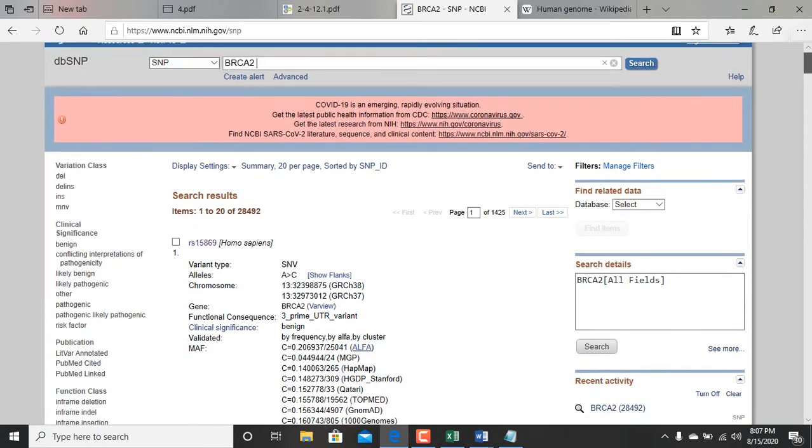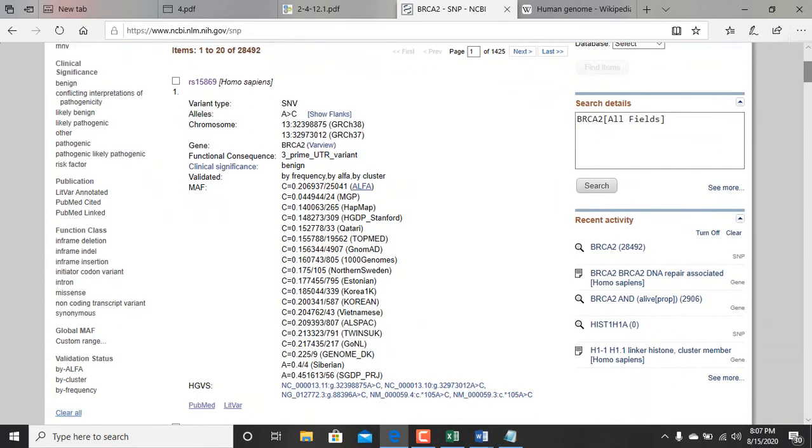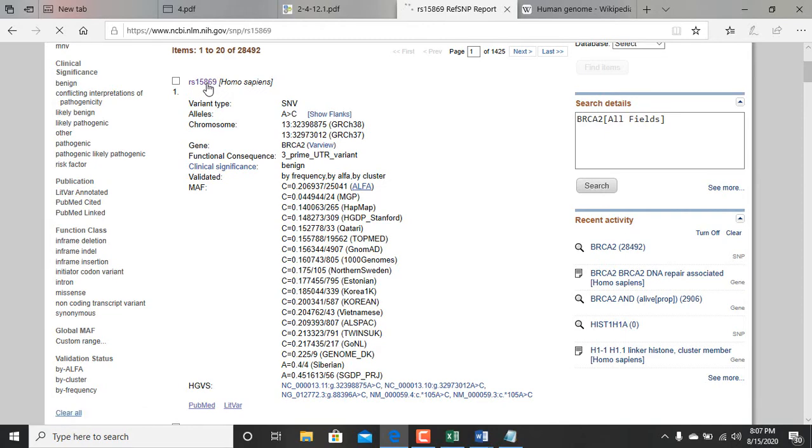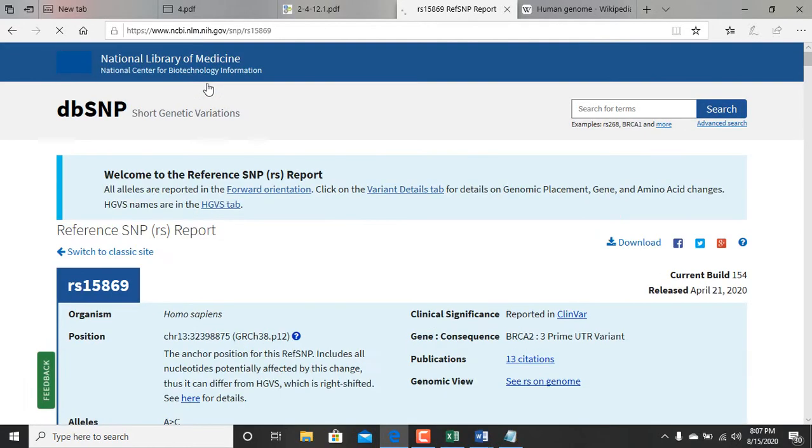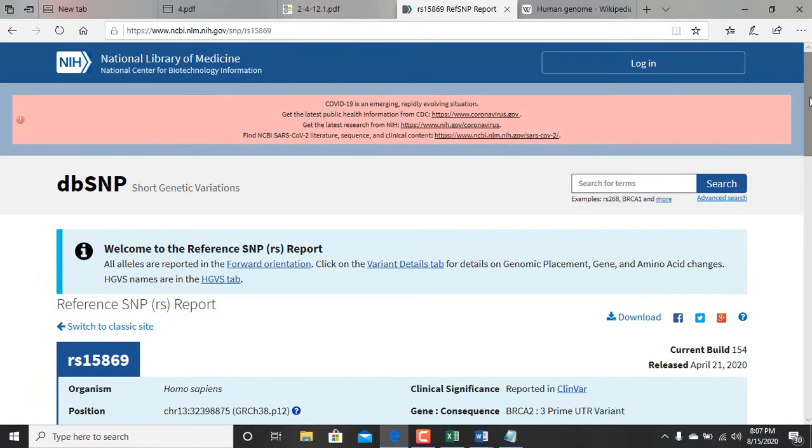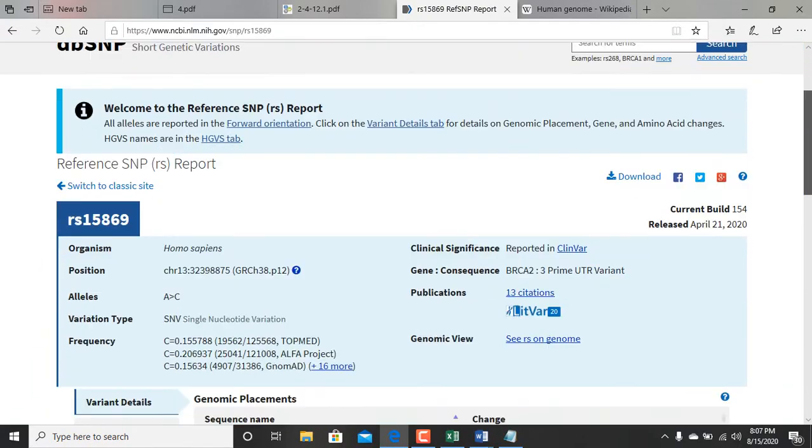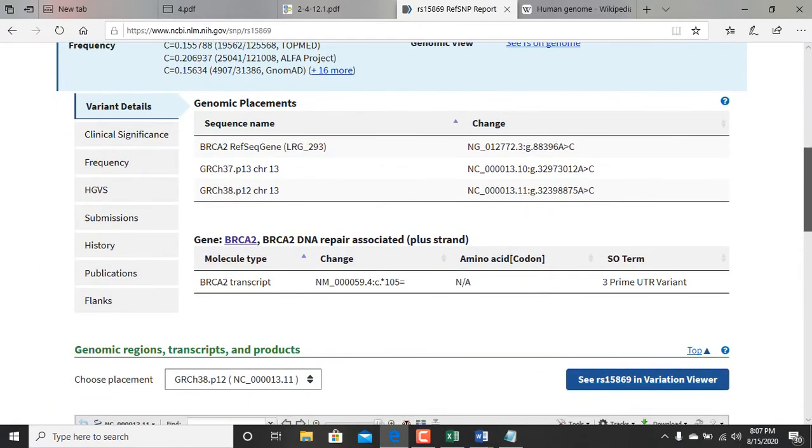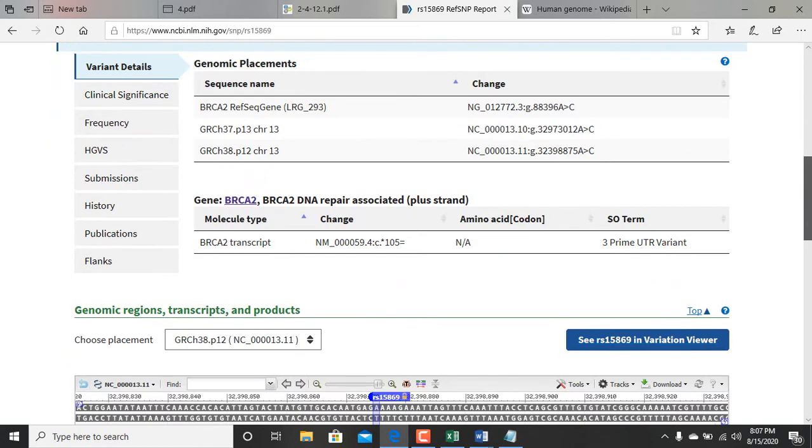You can choose any of these results to check the SNP. Let me use the first one. This is my results, this is what I got.